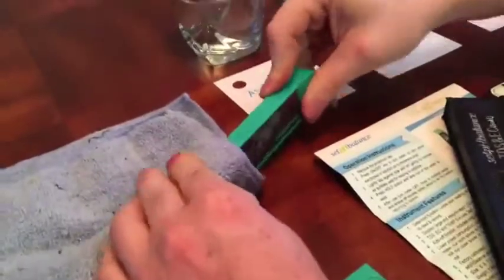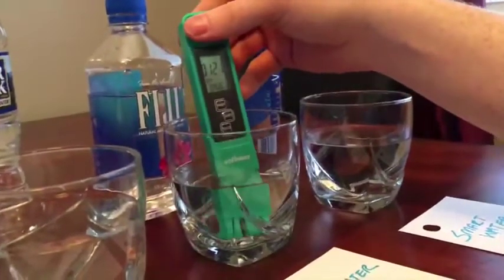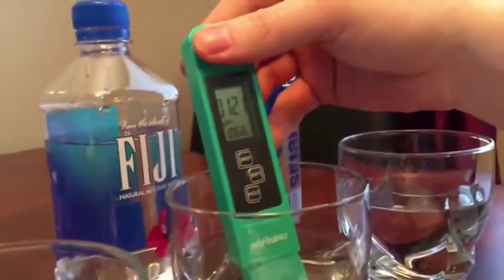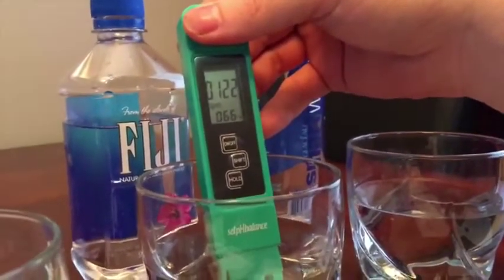This right here is a great tool to tell you if your spring water has additives. All right, let's test Fiji water, this really expensive, highly sought after artesian well water. Oh my gosh. That's reading 121 parts per million. That is not even acceptable by the EPA.